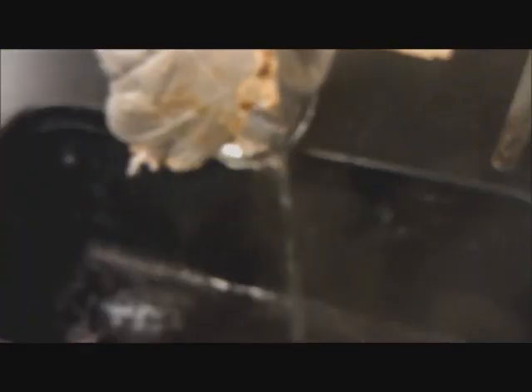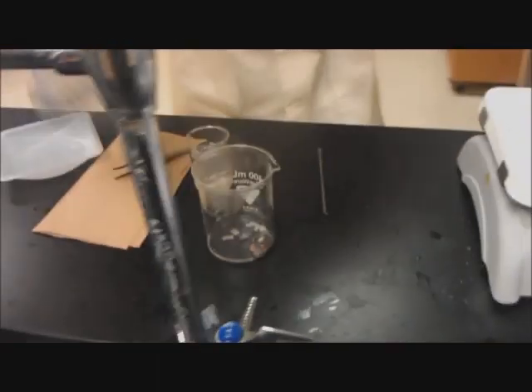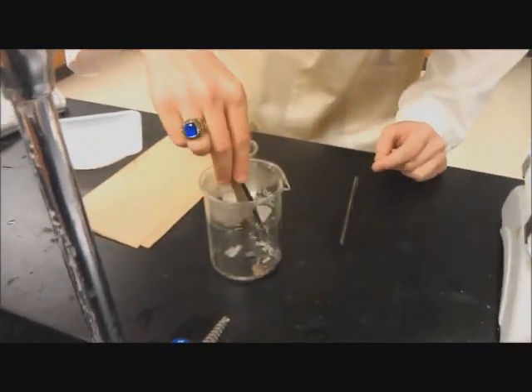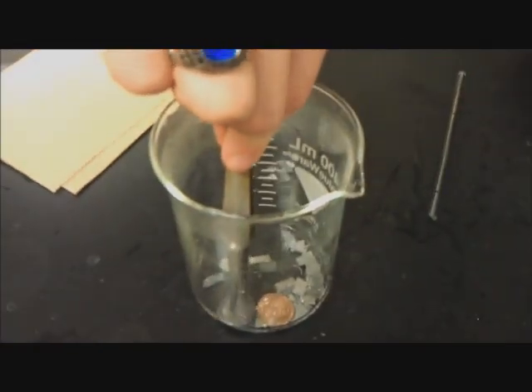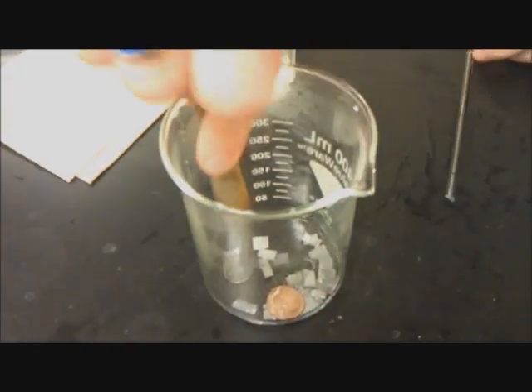Now we're going to take the solution, which is safely disposable. We're going to dump most of it out to get the pennies out. It's very, very hot — it's boiling — so get as much of that out of there as I can. Now we're going to use our tweezers to grab them. See how good I am at grabbing the pennies out — not very.